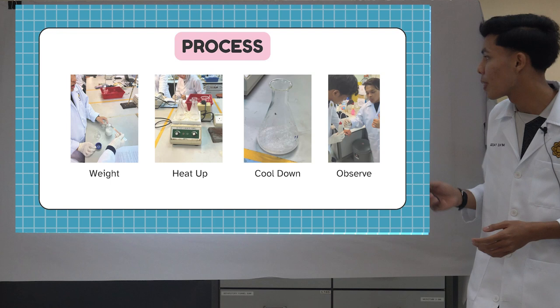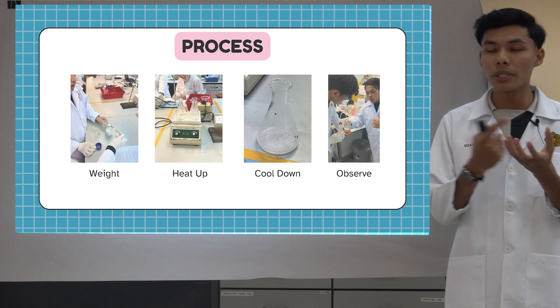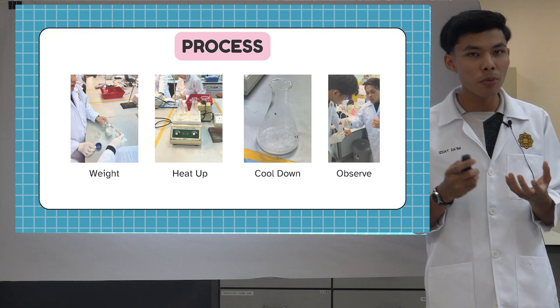So actually, if we look inside the flask, we can see the solution, which contains the impurities in a liquid solution, and we can also see the crystal, which is our pure product. Okay, so for the next part, we're going to discuss our result.